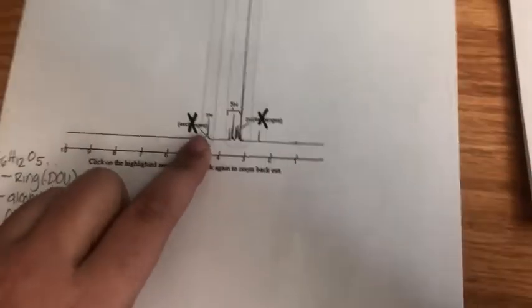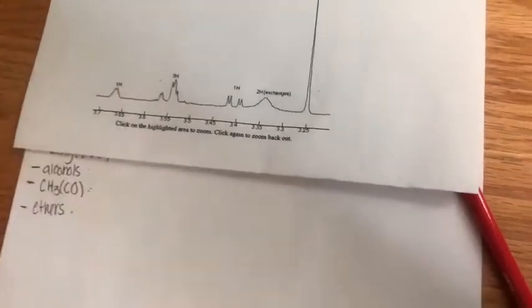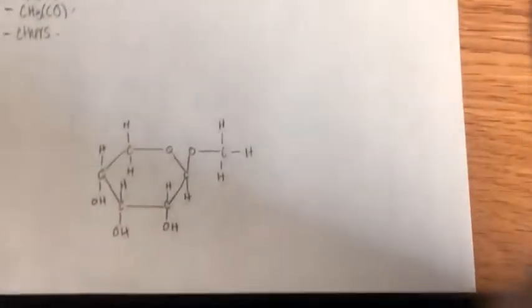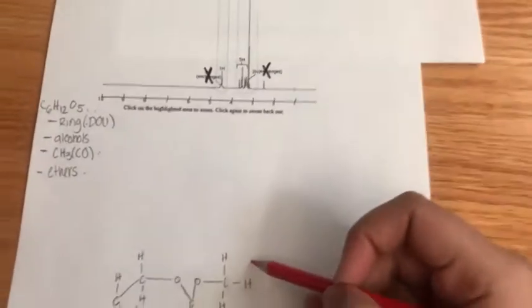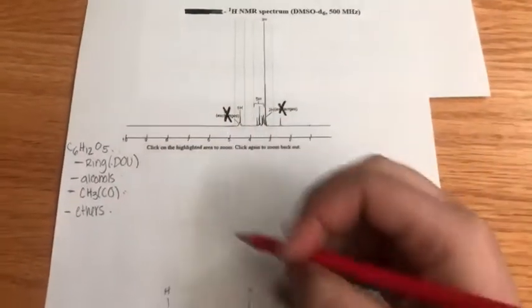They actually have little readings that pop up on HNMR. And in the zoomed in version, we're going to do that as well. Just mark out this 2H exchange, which was just the same one that I had marked out right here. The first hydrogen environment that we're going to match up is going to be that CH3 because it's the easiest to identify, and it's with this 3H right here.